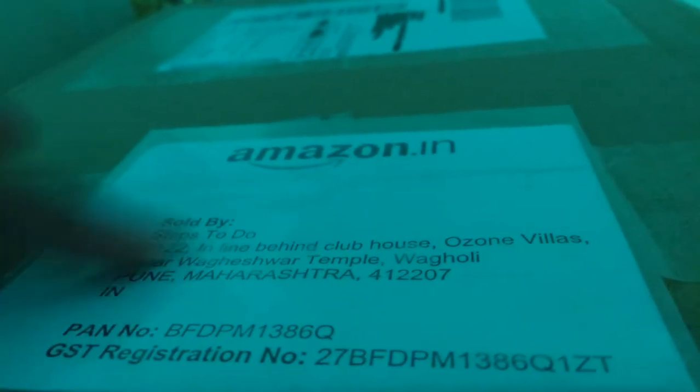So what is inside? Inside it is a chemistry set that is sold by Steps2do. And this is all. So now let us open the seal.